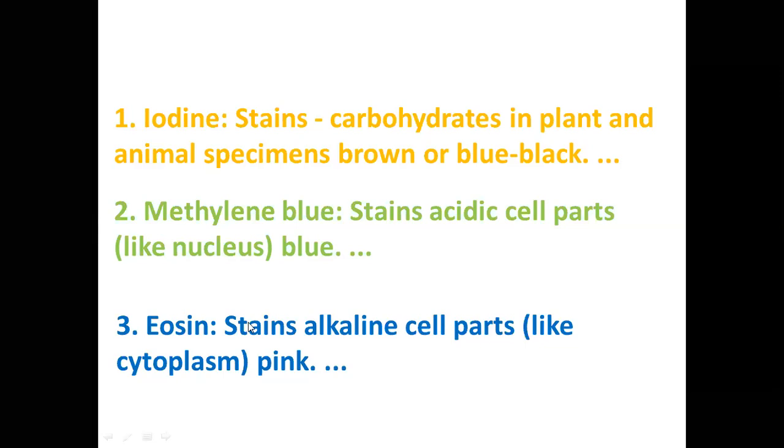So, we may not have a situation whereby we stain with a compound dye. So sometimes what we see as a cell under a microscope may not be the best view possible, because if we use different stains, we will see different structures. So different stains will stain different parts of the specimen. And that's why it is good to be aware of this. It depends on what the examiner wants. But given that this is high school, we may only use one stain per practical.